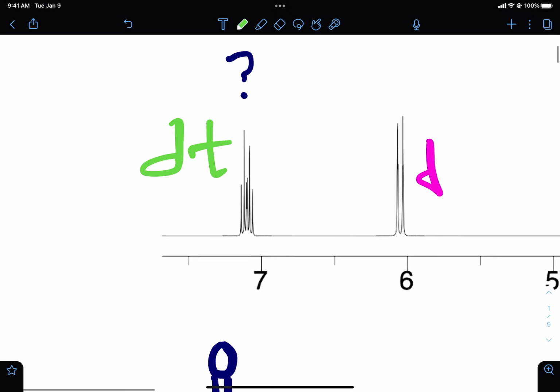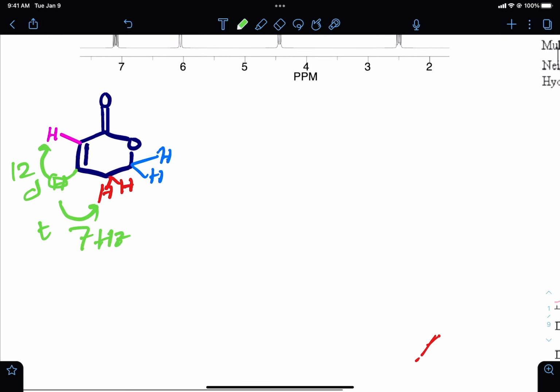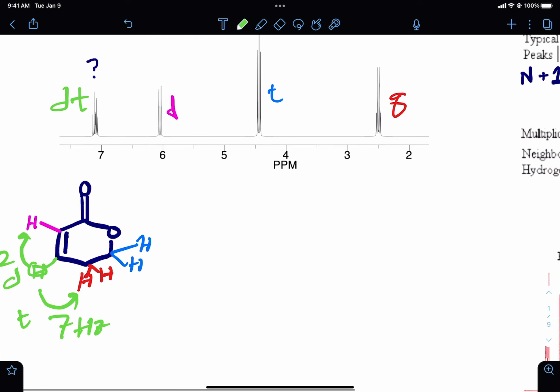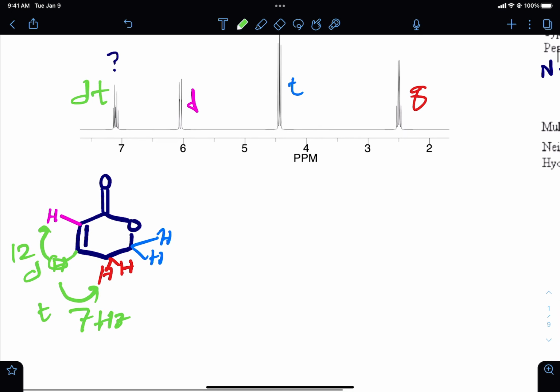Because first of all, that's what our structure says it should be. A doublet of 12 and then a triplet of 7. But if we had the frequencies, it would be nice to be able to see that. But in a real life situation, you'd have access to those numbers. If you were to walk into a spec lab and take an NMR spectrum, the printout of your spectrum would have all of the frequencies, and you could go through this process and do that.